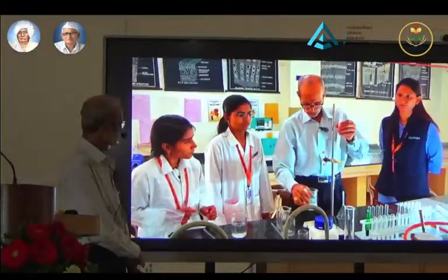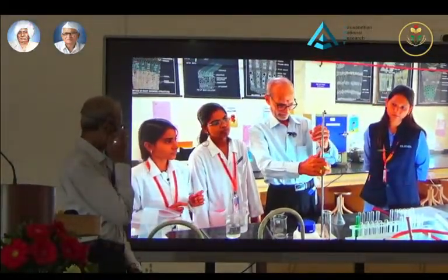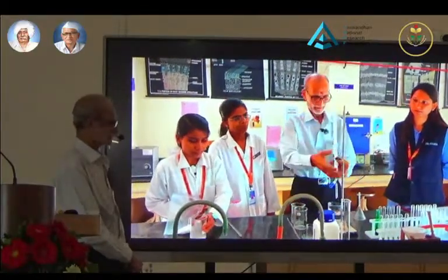The slurry has been put into the column. Water is allowed to drain.